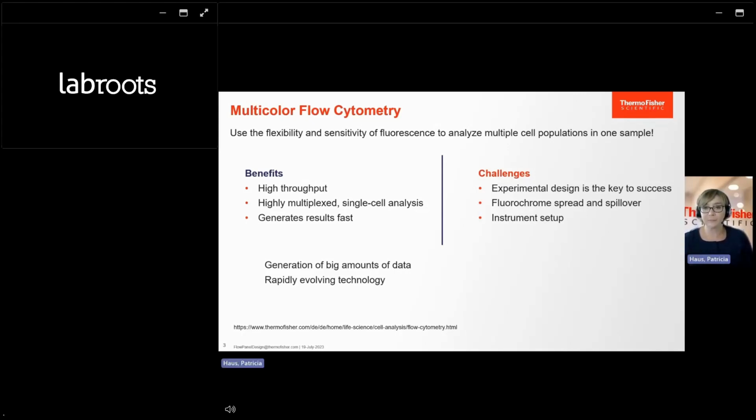A flow cytometer allows you to distinguish cells based on size, but also cells based on their granularity. You know, this is where flow cytometry came from. That was the basics. But nowadays, we want to know so much more, isn't it?